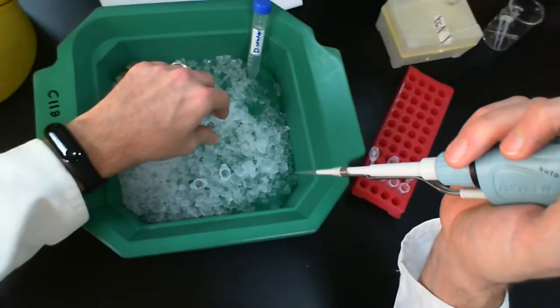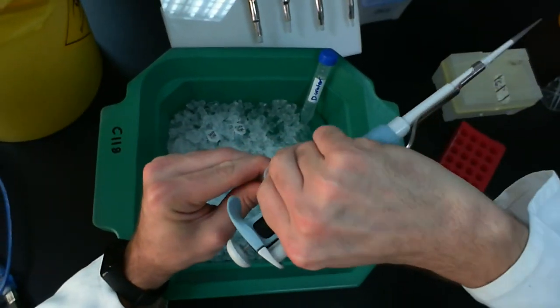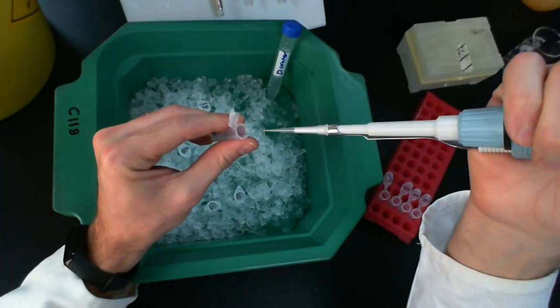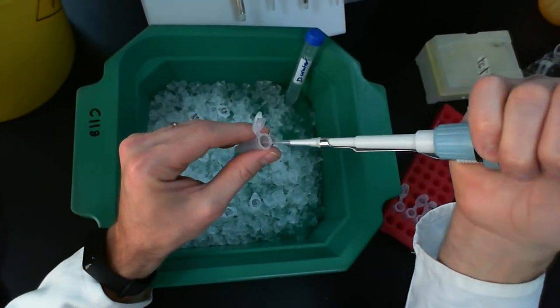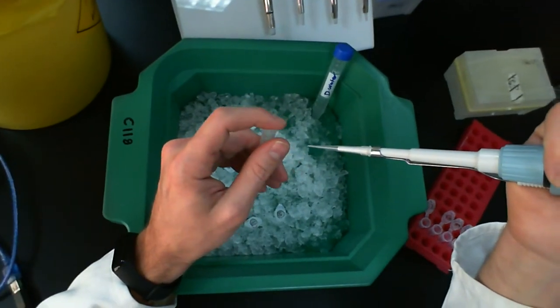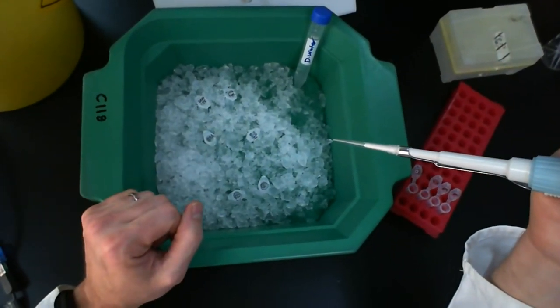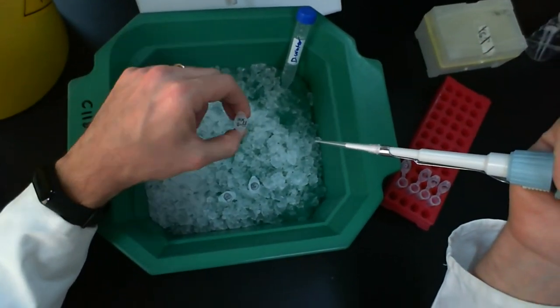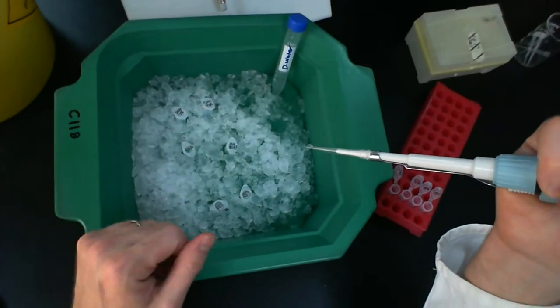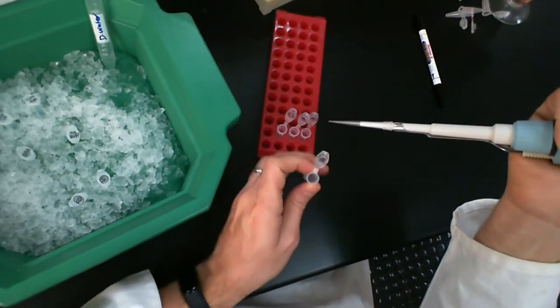That's working concentration would be 1x. Its current concentration is 10x. Okay, and so that means that I need to dilute this in order for it to have the appropriate concentration. My final volume is going to be 20 microliters. My final concentration will be 1x. My initial concentration is going to be 10x. So you can use C1V1 = C2V2 to calculate what volume to use, and it happens to be 2 microliters. Okay, so I'm going to add that to every one of these tubes.